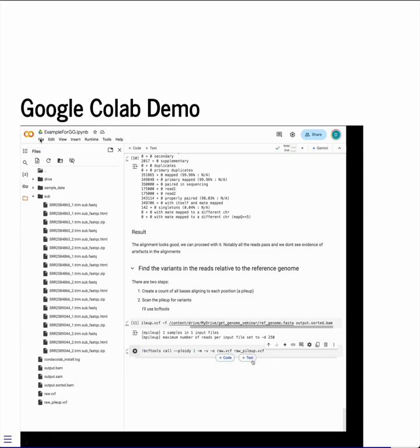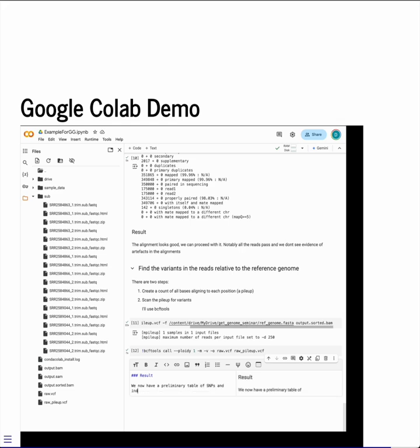Okay. Finally then, I can record my result and have a quick look in the variance file. So this isn't a very in-depth examination. I'm just going to have a quick look because this is a tech demo. It's worth pointing out as well that this is a completely unfiltered set of variants, and variant calling is very false positive rich, shall we say. So it's often the case that you have to do some filtering. I've completely skipped that step out here. We'll just have a quick look.